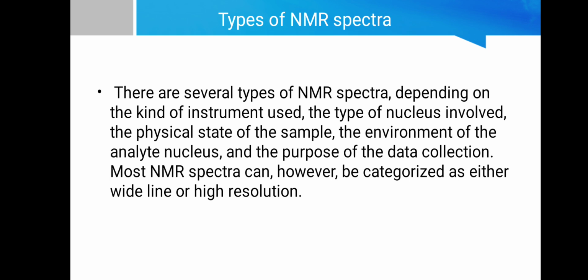There are several types of NMR spectra depending on the kind of instrument used, the type of nucleus involved, the physical state of the sample, the environment of the analyzed nucleus, and the purpose of the data collection. Most NMR spectra can, however, be characterized as either wide line or high resolution.